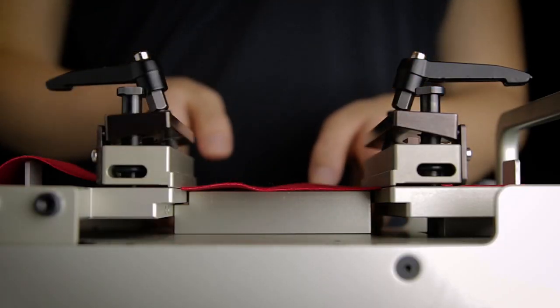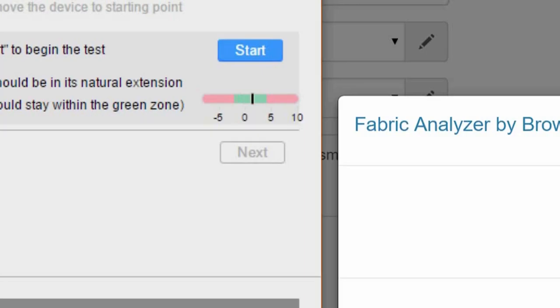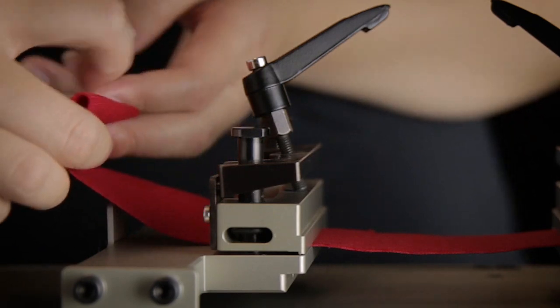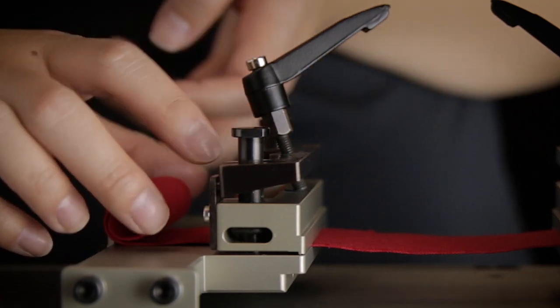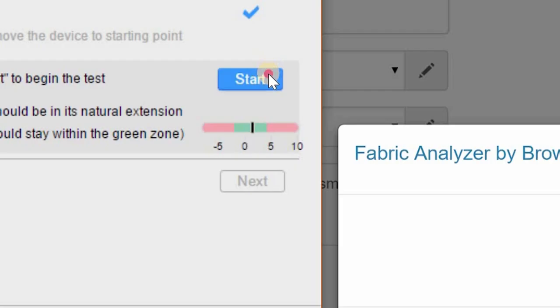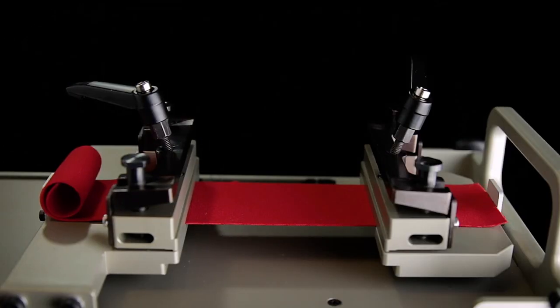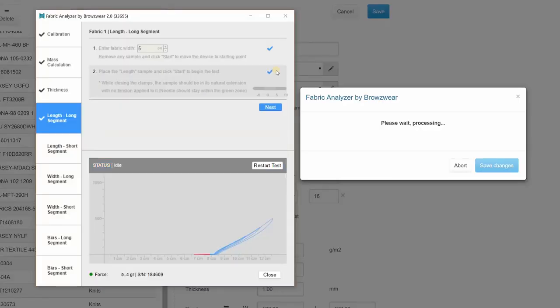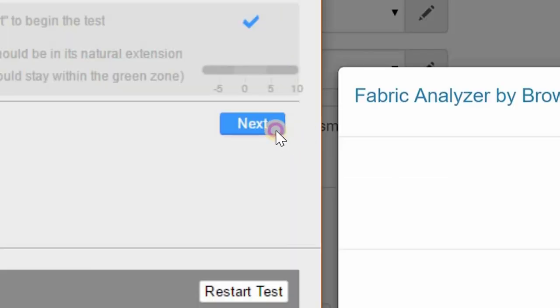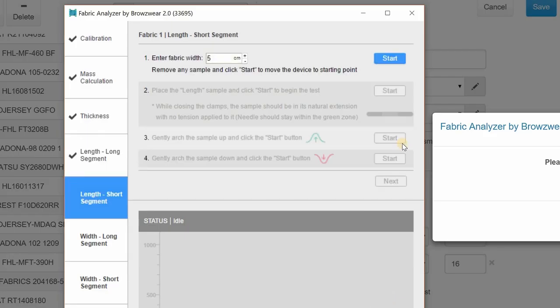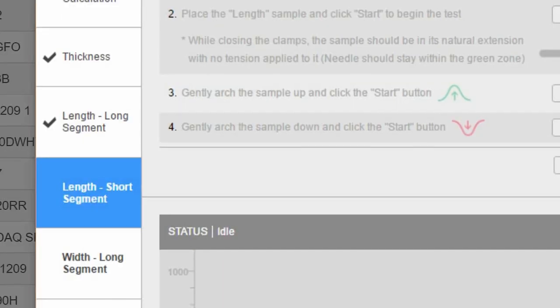Now, remove the spacer and double check that the force indicator is still in the green zone. Fold the excess fabric onto the movable arm of the fab. Press Start to begin the test. The testing time will vary depending on the stretchability of the sample fabric being tested. The next button will be highlighted once the test is complete. Click Next to proceed and note that the test face highlighted on the left has now moved to the short segment test.